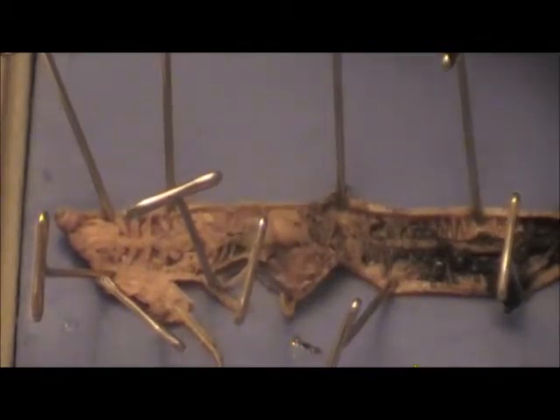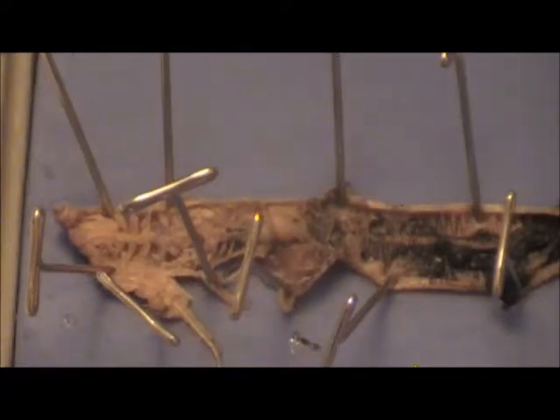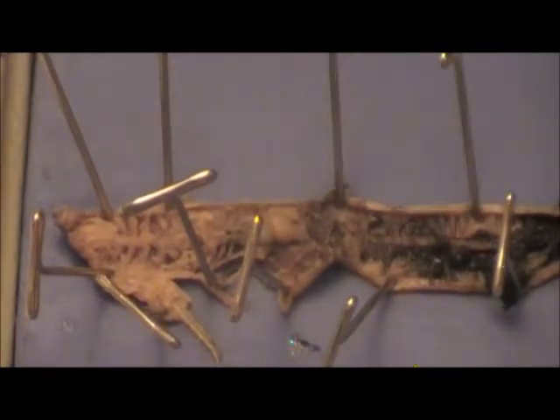Worms are both male and female, but obviously they can't reproduce with themselves. They have to find another worm. Both worms are male and female at the same time. On the clitellum, which is that little tube that looks like a band-aid, which you can't see right now, it's on the back. That might be it right there. Actually, it's right here. It's near these organs. Actually, no, two worms combine right in that area, and they both release sperm, so they cross-pollinate each other, kind of like flowers. And then they both are pregnant, and they both have babies on the inside, so they have male and female reproductive organs.